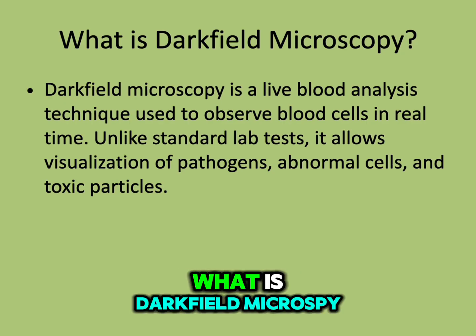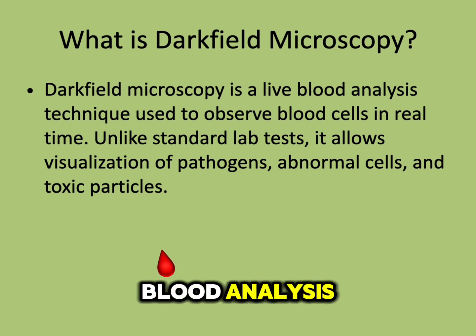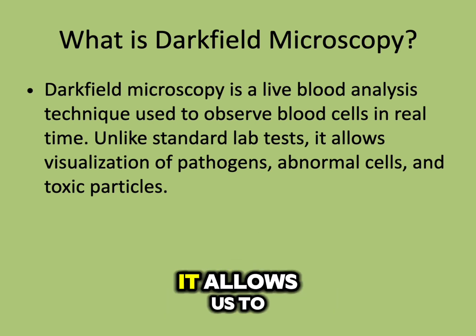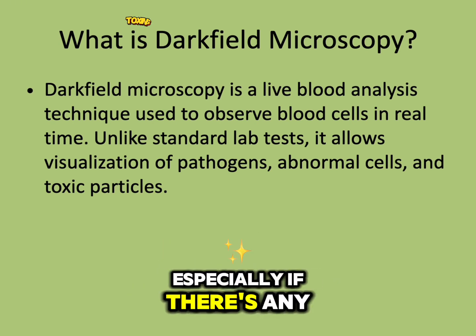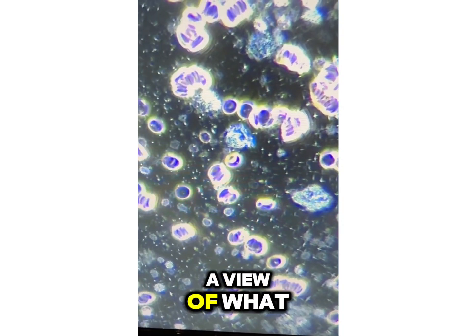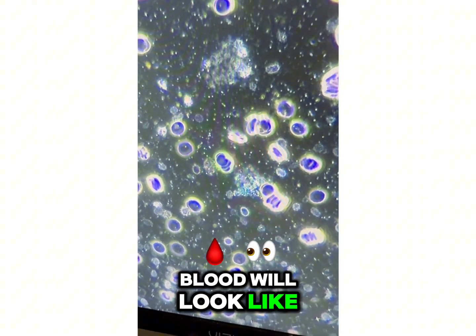So what is Darkfield microscopy? Well, a Darkfield is basically a live blood analysis, and it's a technique used to observe blood cells in real time. Unlike standard lab tests, it allows us to actually see the pathogens in abnormal cells, especially if there's any type of toxins that are out there. So this is kind of a view of what the infections in somebody's blood will look like.